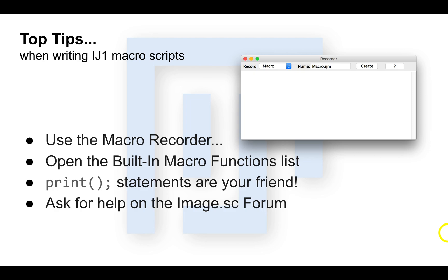These are some top tips for macro scripting in ImageJ. First, open the macro recorder. Always have this open when you're writing macro scripts. The reason? You don't need to memorize code calls. You can always do those calls manually and then copy and paste the code.